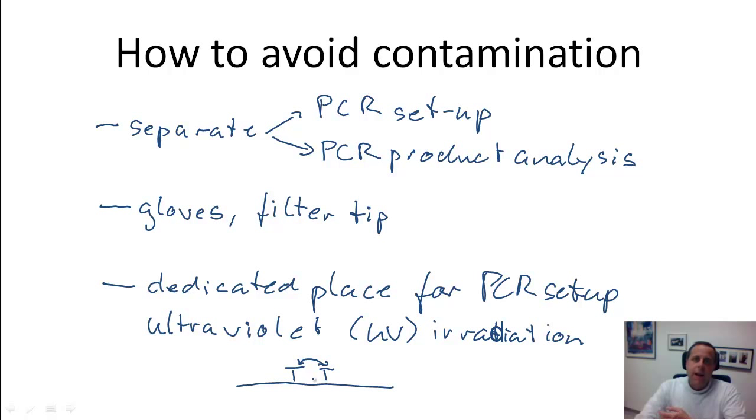And the same will happen to any contaminating PCR product that you accidentally may have spilled in the place where you set up the PCR. The UV irradiation will induce thymidine dimers and other modifications, and this will render it impossible to amplify that contaminating piece of DNA subsequently. So even if you still have it in your reaction, it won't give rise to a PCR product. And that's what you want.